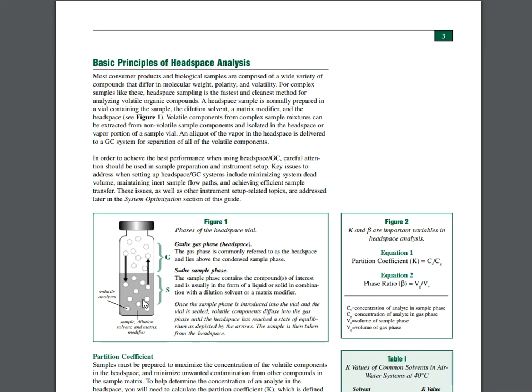And this sample is basically the solvent, traditionally aqueous solvent that I don't want to inject into the system, with maybe some things that I do want to inject into the system. So this will allow me a separation technique that I can then just inject the gas phase only onto the GC system.